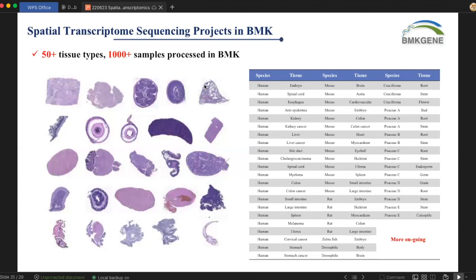What we need to do is capture most or all of the mRNAs released from the sample and then barcode them with UMIs. So it's not necessarily to generate more data for a higher resolution; we have the same number of reads generated for a more detailed clustering of the data. So to answer your question, with a high resolution study, we just need the same or a similar amount of data produced.